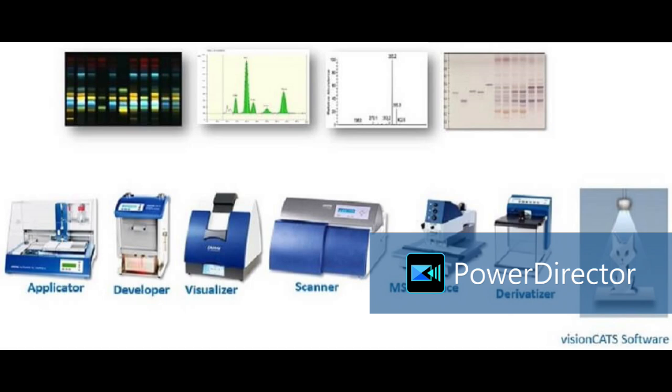So it is 21 CFR compliant, IQ, OQ, PQ qualified. This is a general requirement from the pharma industry. So this is the stepwise practice of HPTLC. Sample preparation and literature survey is key behind any analysis. If we prepare it properly, whatever we are taking in our final aliquot or separation, if that contains more of your analyte of interest, then only the machine will show proper things.